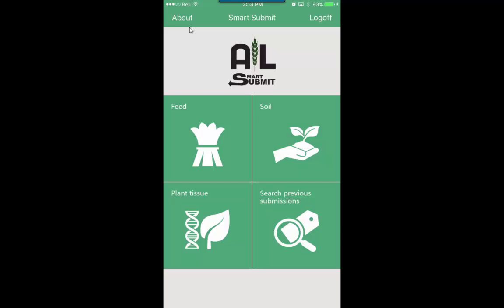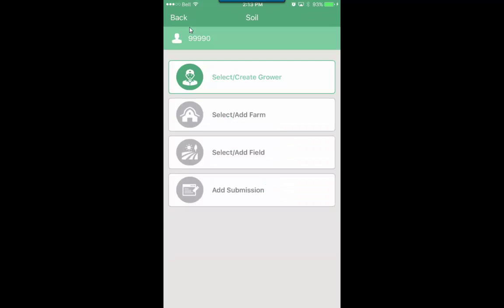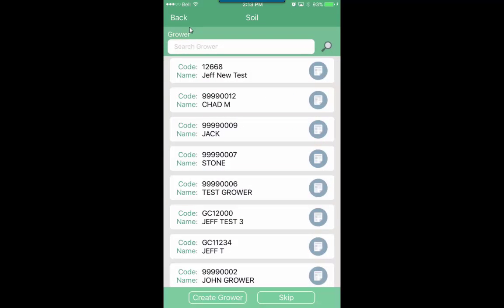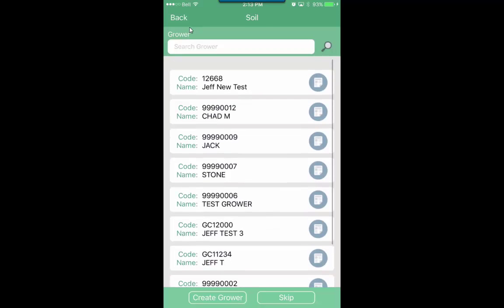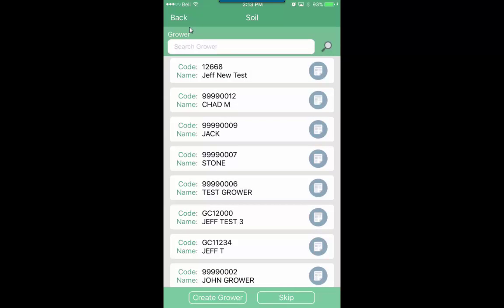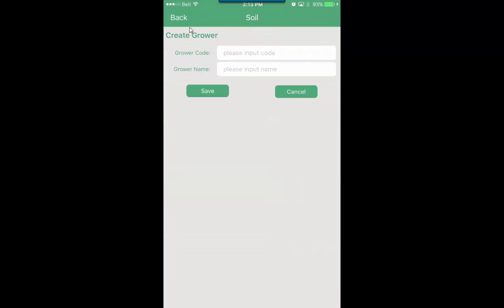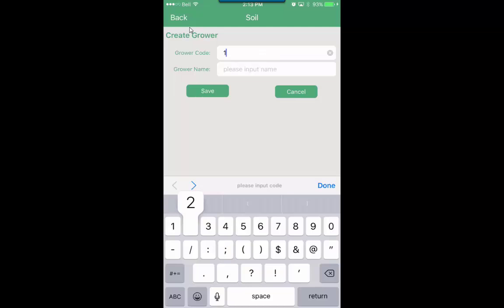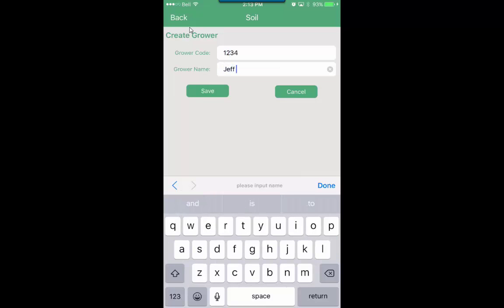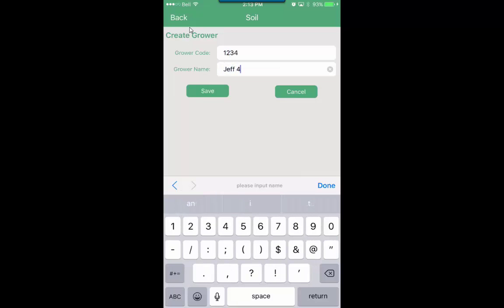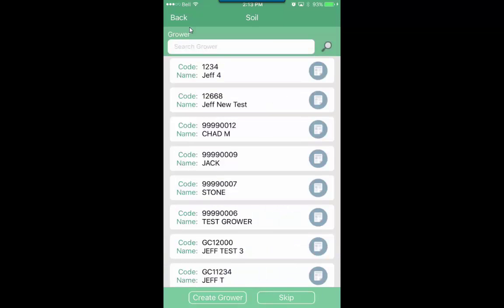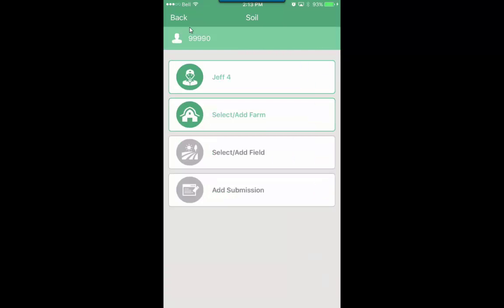We'll take a look at soil here quickly. We'll click on soil. From here you can select or create a grower. You can select a grower from the list here or we can create a new grower down at the bottom left hand side here. Give it a code and a name and save that. You'll notice that the one you just created is right at the top of the screen there, so we can select that grower.